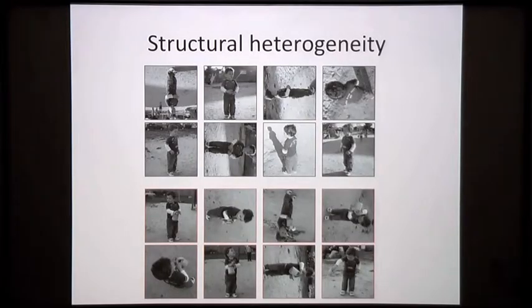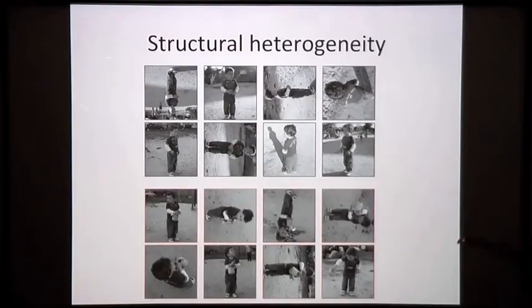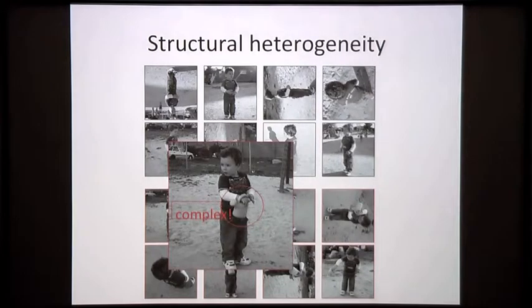Now, of course, these are then 3-dimensional machines in different orientations. So what we just did for the 2-dimensional classification, we can now just carry over to 3-dimensional classification. Let's first look at these experimental images of a certain molecule, and this is in complex with a cofactor, okay? What you would really want to do is separate the 2D projection images of these out, so that you have all the complexed ones and all the uncomplexed ones in two separate reconstructions, and do a reconstruction of both of them, okay?